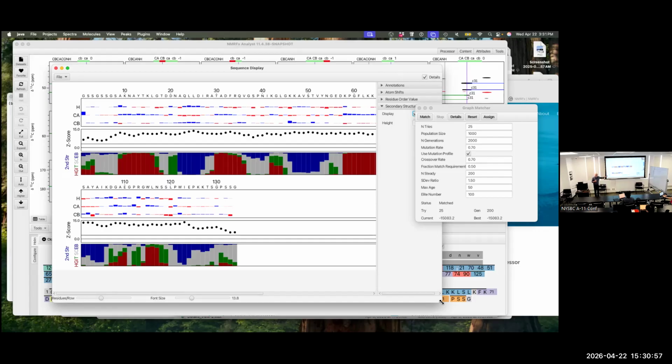In the RNA world, things don't work exactly the same, but we have a nice tool. We can predict secondary structures of RNAs with a deep learning model. We can then predict what the chemical shifts of that secondary structure are, and then predict where peaks will appear in your spectrum. Then you can use a slider tool: when you slide a peak from its predicted position onto the real peak, you see a whole cluster of related peaks for that atom move close to theirs. So you can very efficiently assign RNAs.